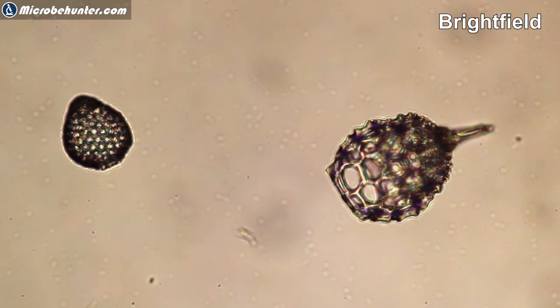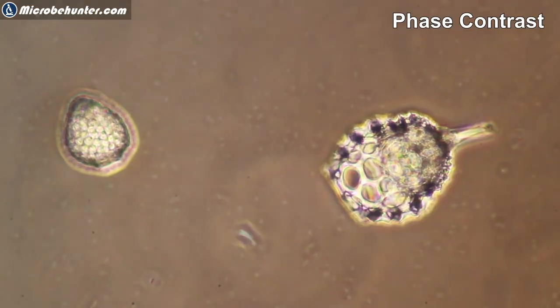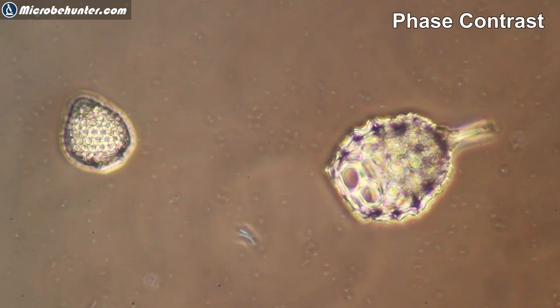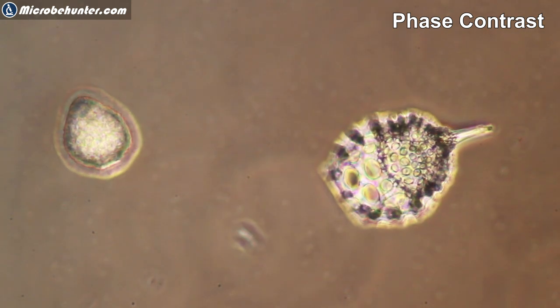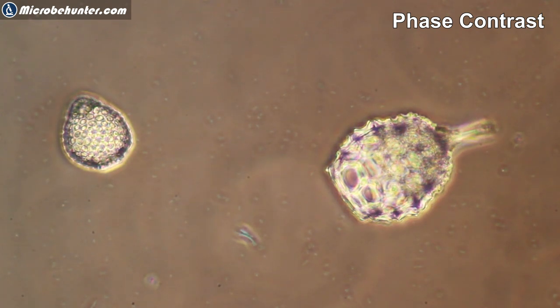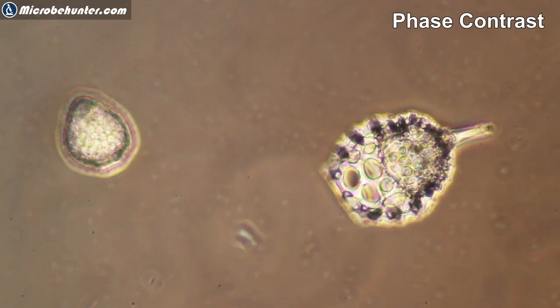Bright field. These are radiolarians. That's their shell made out of glass, of silica. Looks quite nice here. And what I've decided now is I also tried out dark field right now because they also look quite nice in dark field.